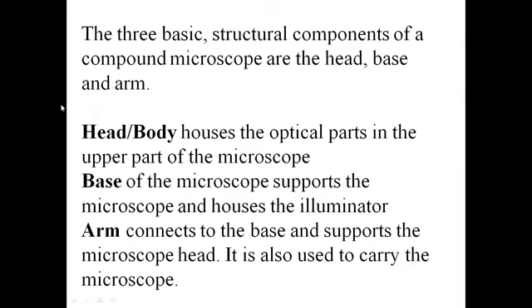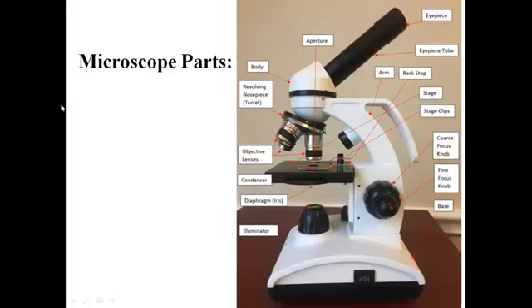Then we'll discuss the different parts of the microscope. You might have seen the microscope in your college and schools. Different parts of the microscope, as we can see, this portion is your eyepiece. Okay. In the microscope, the optical part generally consists from this portion up to this area only. Okay. Important portion, that is the head portion.